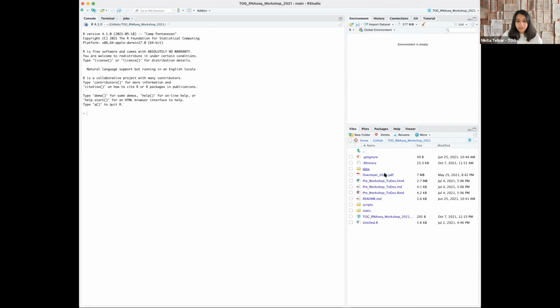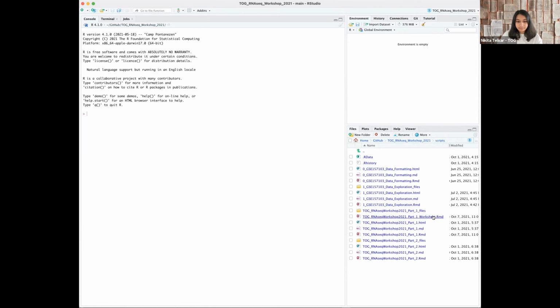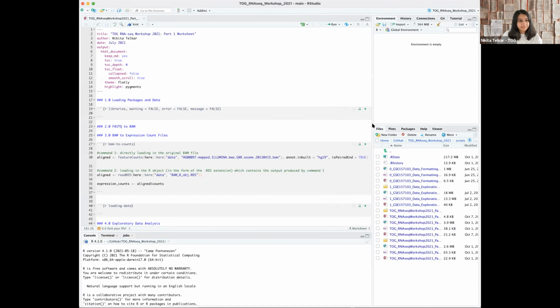And then if you go into the scripts folder, and I know there's a bunch of these here, just the worksheet one, we just open that and we're ready.